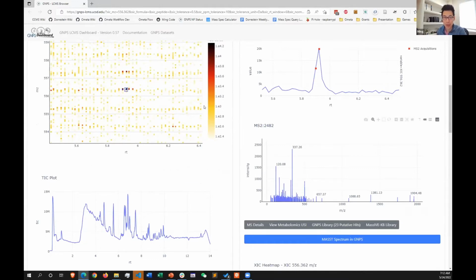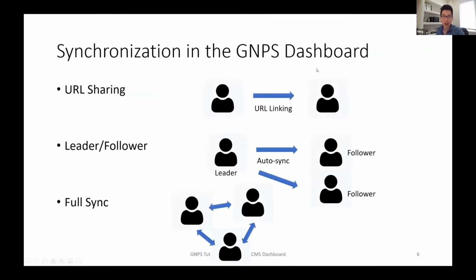And there's a lot of interdependence. If you click on a particular point here, on the left-hand side, it'll update the XIC and the MS/MS. So everything kind of links together. If you click down here on TIC, it'll show you an MS1 peak in this MS visualization. So we'll walk you through a little bit more of the features of this, and I'll play around with it a little bit in just a second.